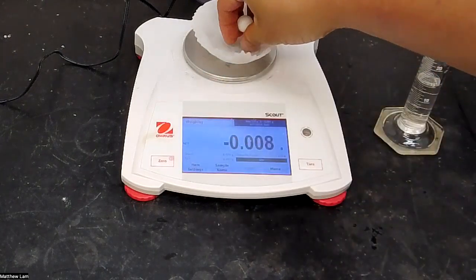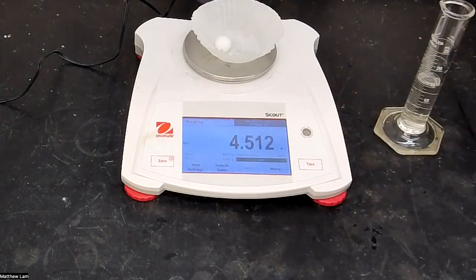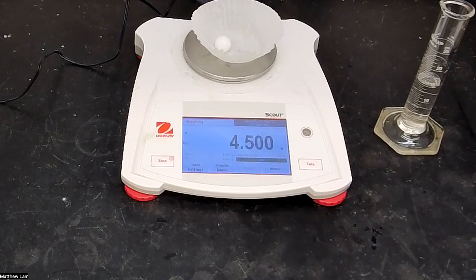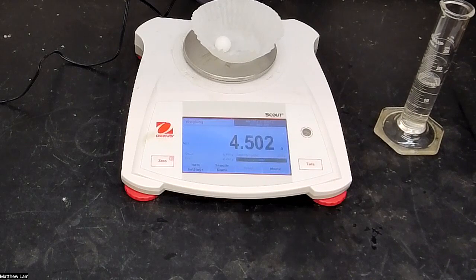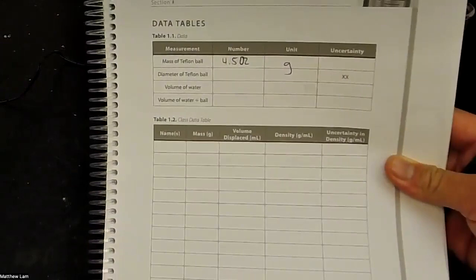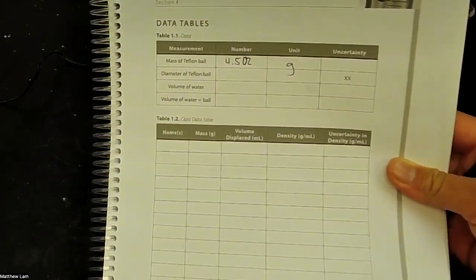And so we put the Teflon ball on there and we weigh the mass of the Teflon ball. Now it looks like the mass of the Teflon ball is about 4.502. And so we'll write it in our lab manual: 4.502 grams is the mass of the Teflon ball.